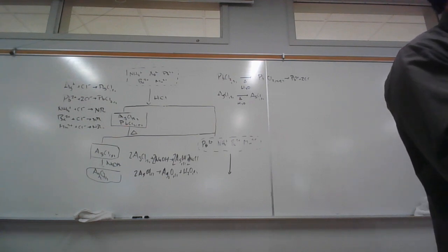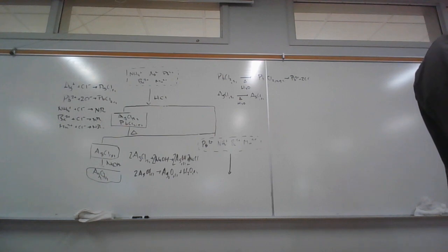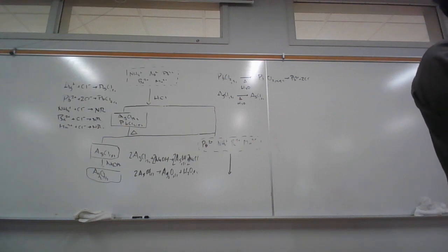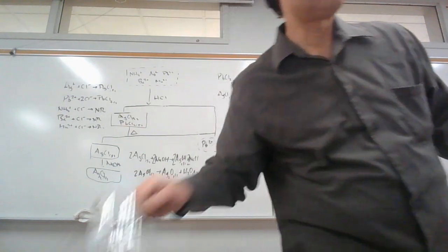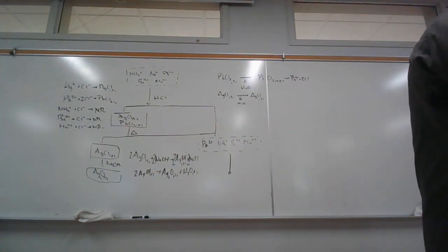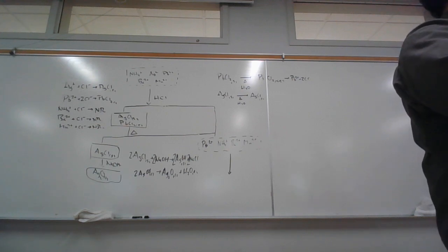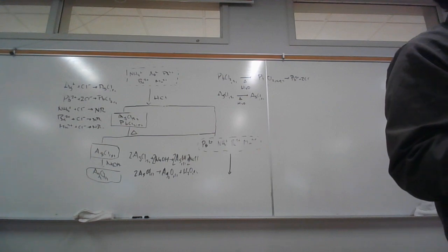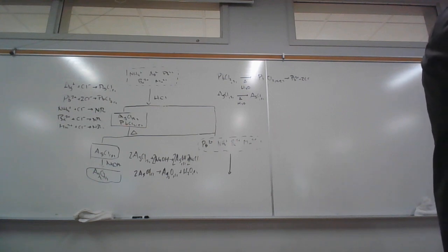The first washing is going to be hot water. So you'll get a little bit of the hot water in there, and in this case, you want to stir it up to make sure you get as much precipitate over as possible. And so that's your first wash. You're going to catch that in the filtrate. Okay, there could still be some stuff stuck in here. And so your second and third wash, we switch it over to the waste beaker. Usually we use a big beaker for the waste. The waste jug is back there, and so I don't want to be walking back and forth continuously. So put the waste beaker in there. Your second and your third wash, you can really use a lot if you want to transfer it over. Right. And so second, third wash to transfer it over, and also to wash the precipitate inside the filter.